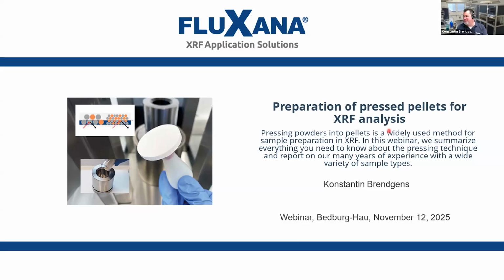FLUXANA, being a manufacturer of fusing machines, obviously does a lot of analytics on fused beads, but we do quite a lot of press pellets as well. And we also have the presses that we sell. So let's get into it and see where it leads us.